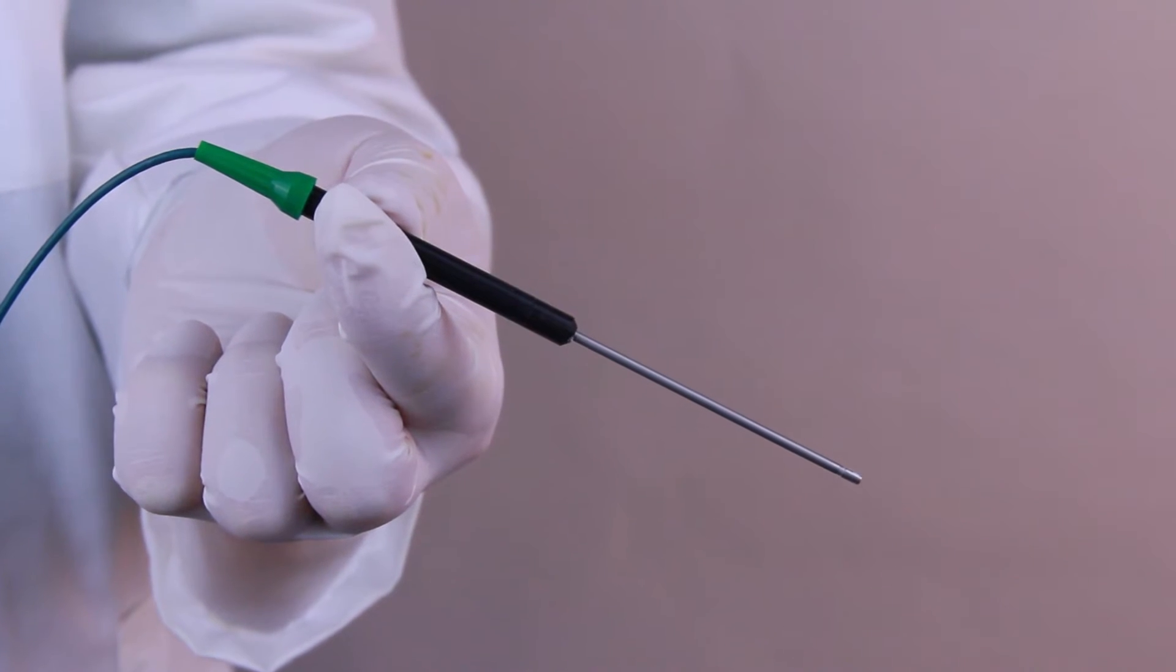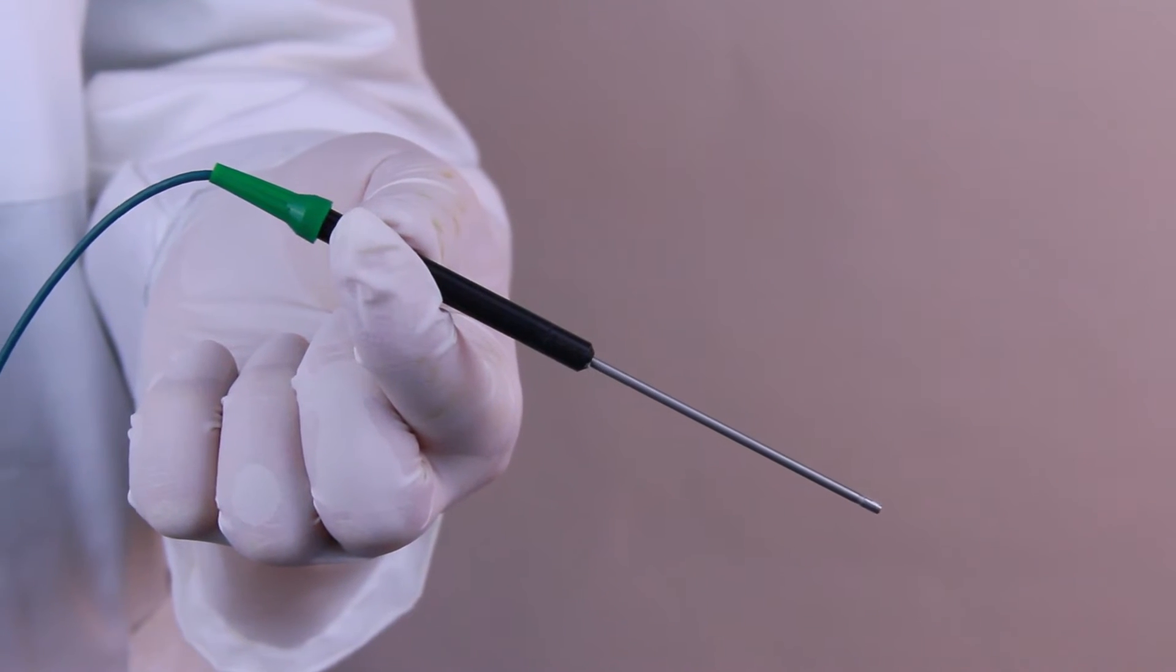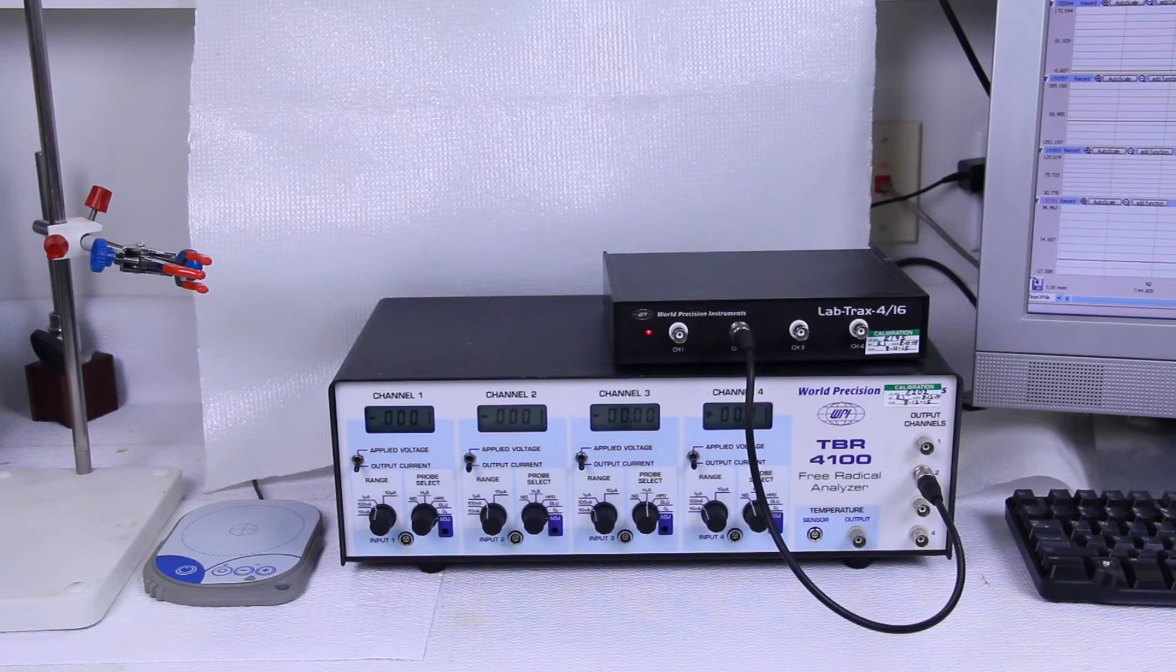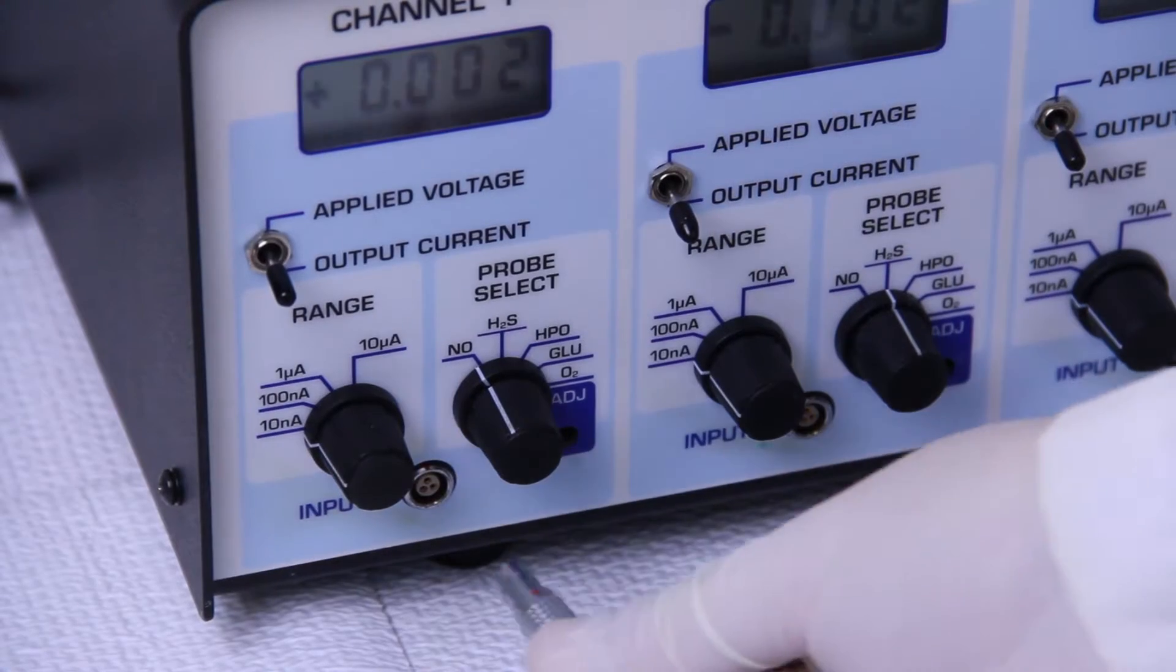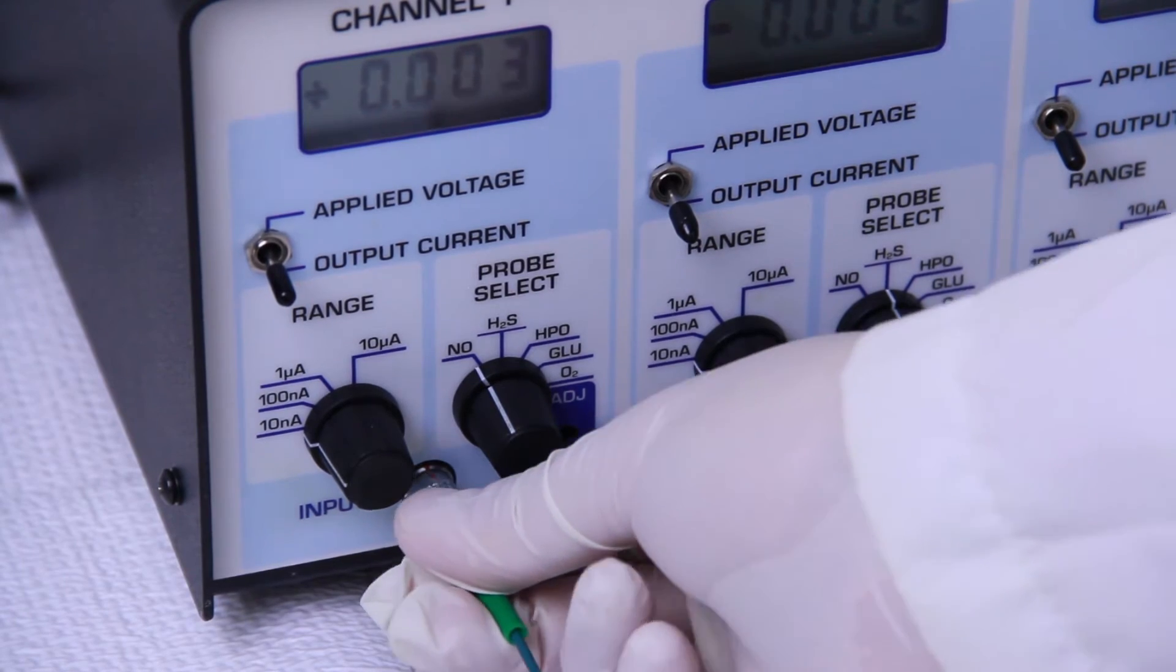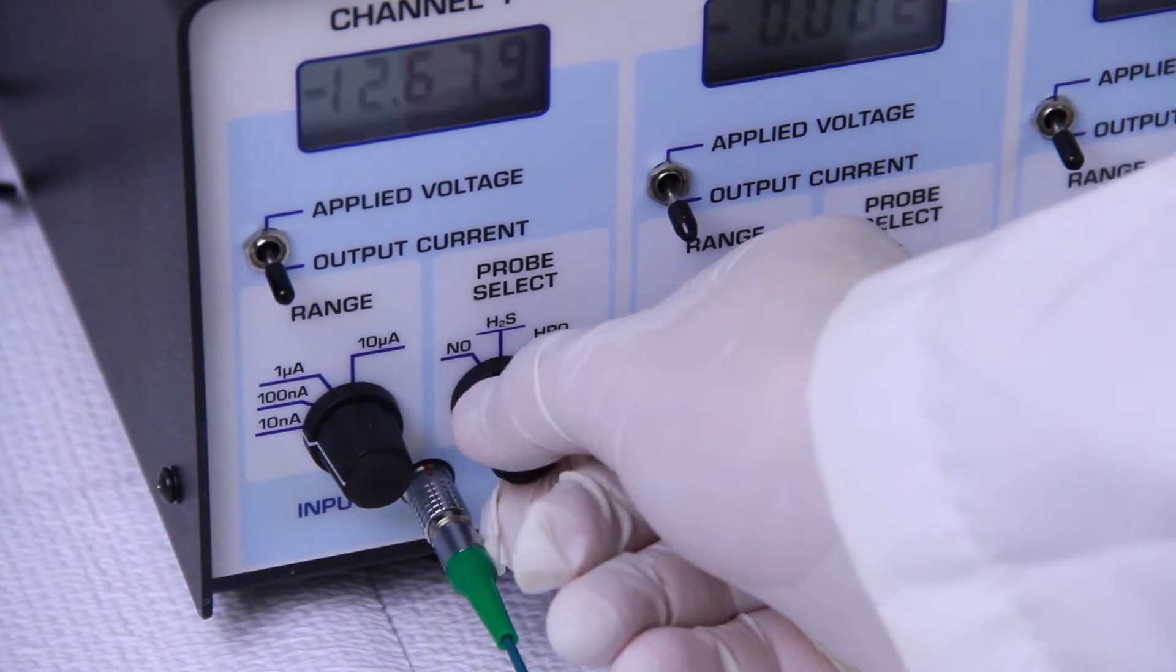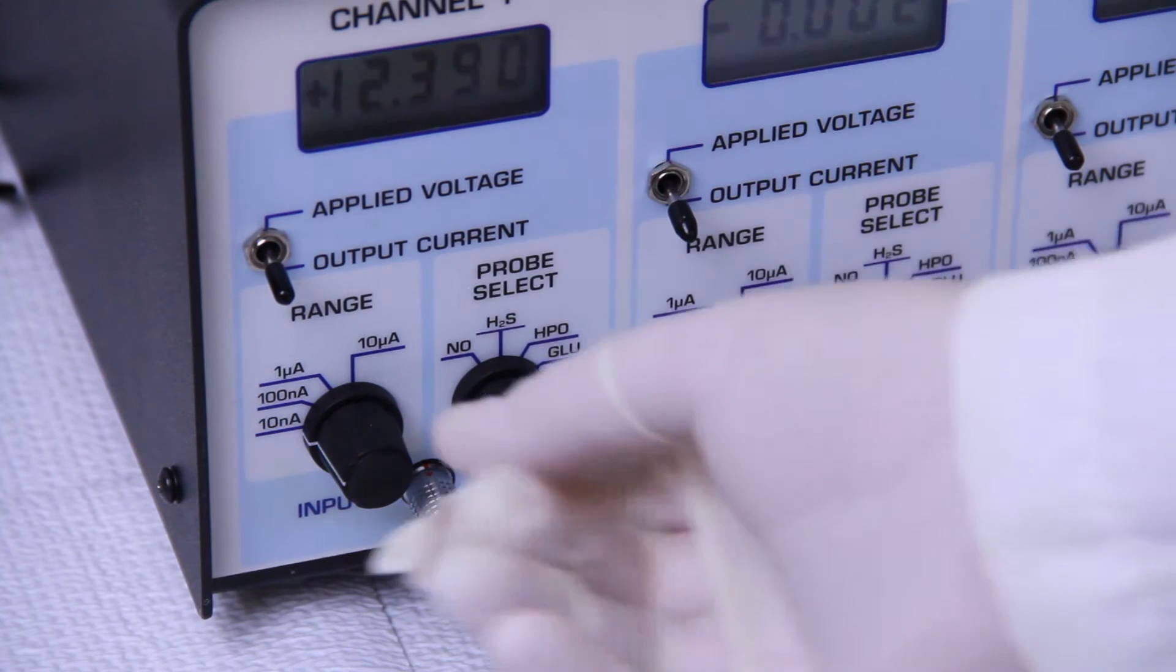Before the sensor can be calibrated, it must be allowed to polarize for at least an hour. Connect the iso-oxy-2 sensor to the TBR4100, set the probe select to oxygen, and set the range to 100 nanoamps.